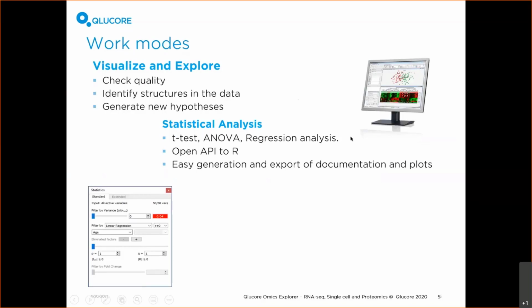We have a couple of built-in methods. We have a couple of methods that are available via our interface to R. Here you can also plug in your own R-scripted methods, and you can easily export your results as lists, reports, and plots.